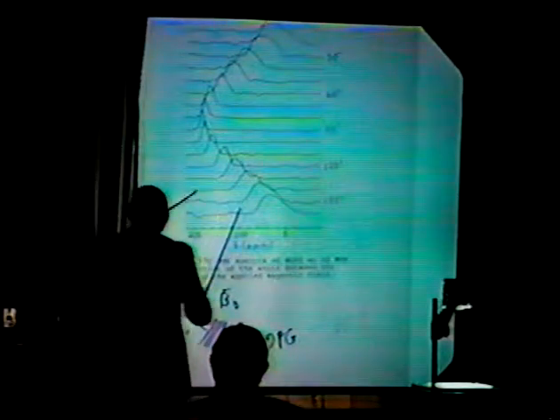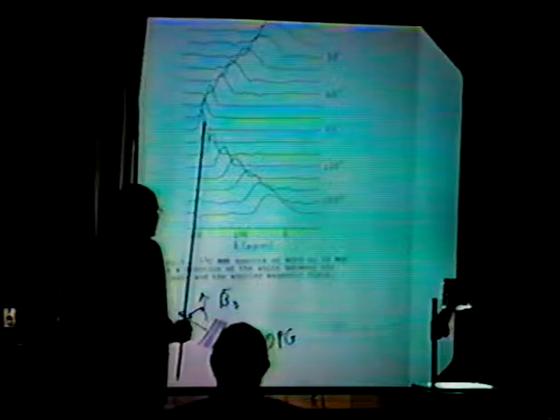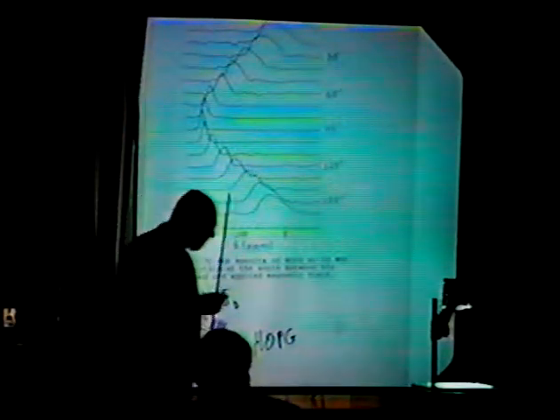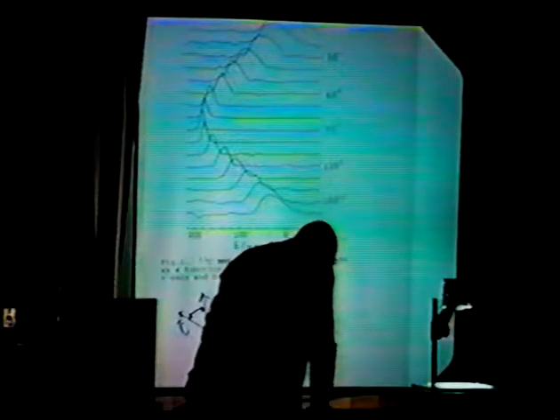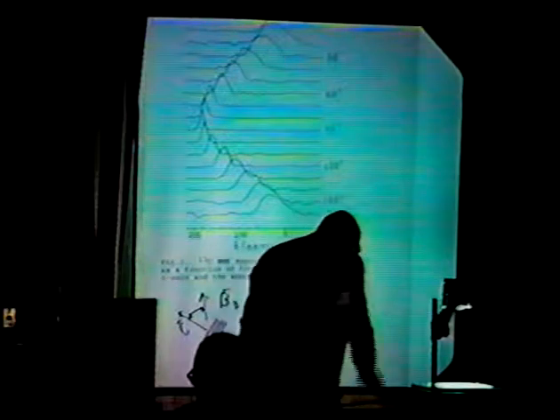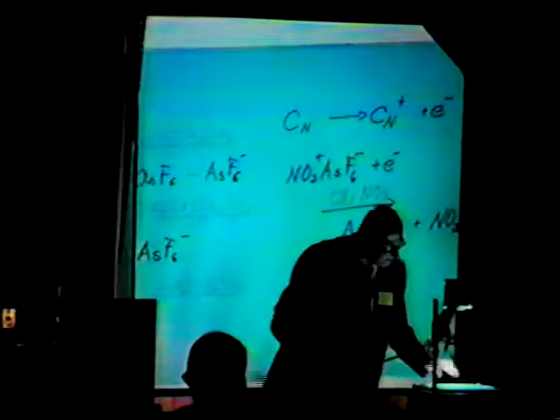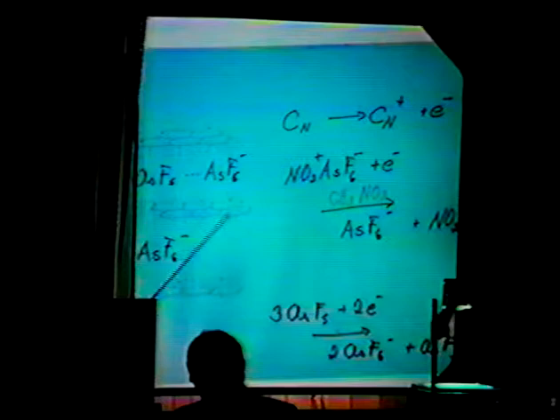But nevertheless, they do show a dependence on the orientation. So this is how the chemical shift looks for the best graphite that we have been able to get. So we're trying to understand why those lines should be the way they are. Well, we're going to take a long, roundabout way to do this.